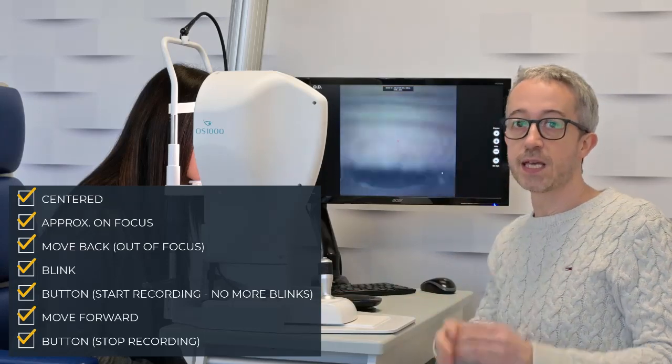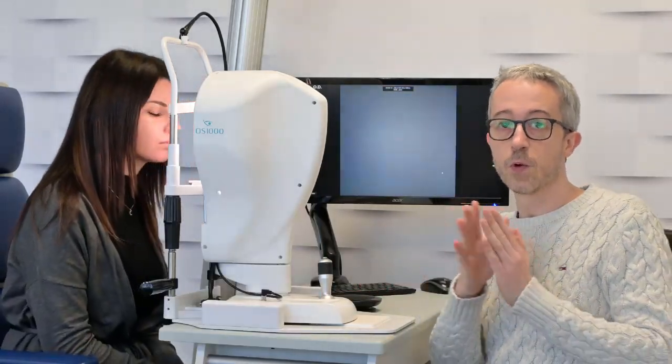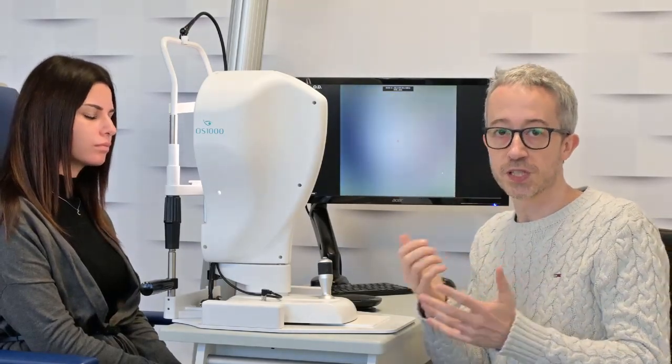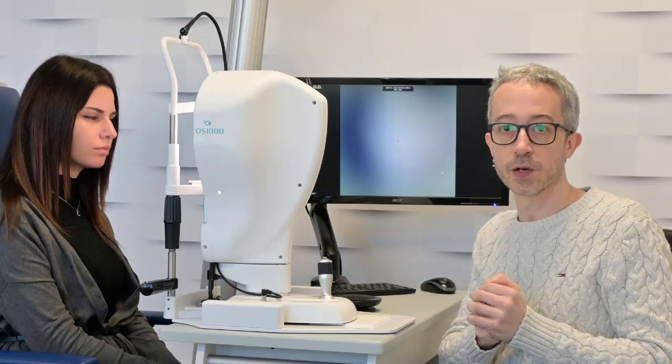So in this way, we acquired a video where at least one frame will be perfectly on focus to proceed with the elaboration of the topography.